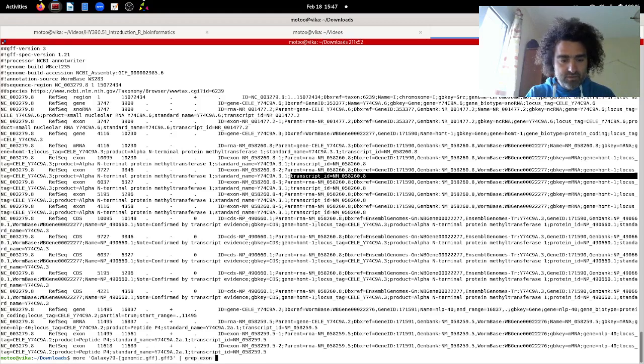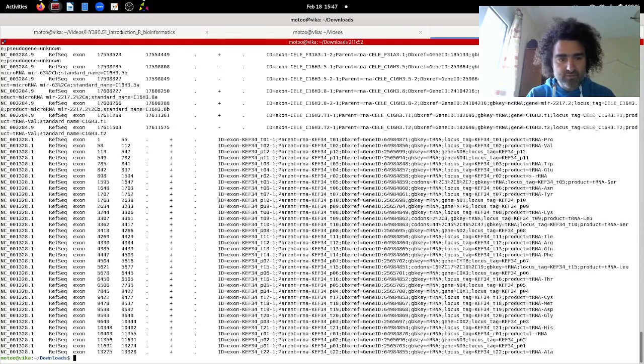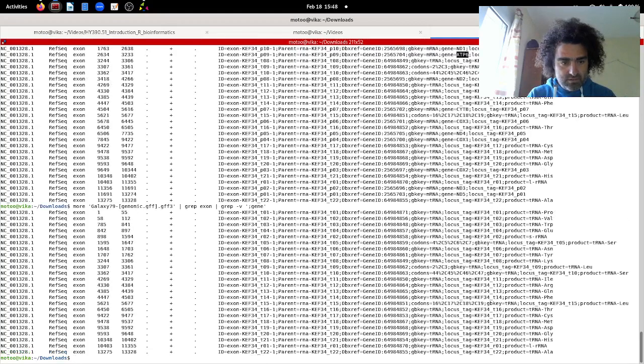There are several exons like that. I search for the word exon, and then I search for the lines that do not contain the word transcript ID, and there are several of them. For example, this line contains exon, but here there is nothing like transcript ID. If I search for something else, even the name gene, there are some records that do not contain the gene.